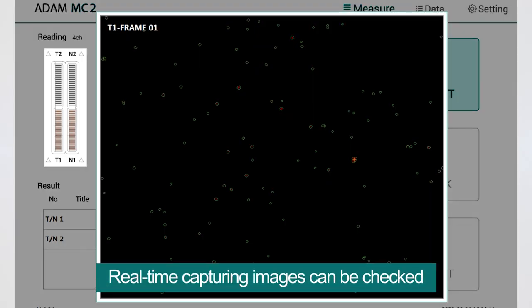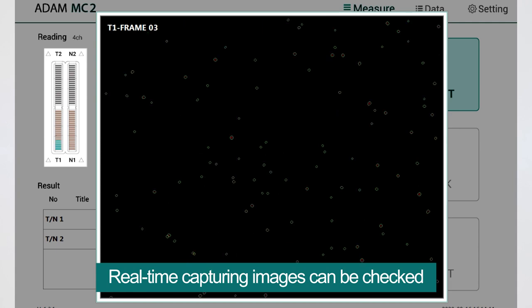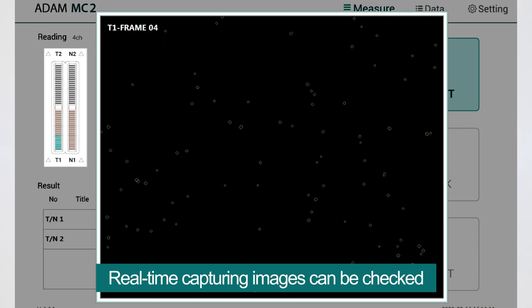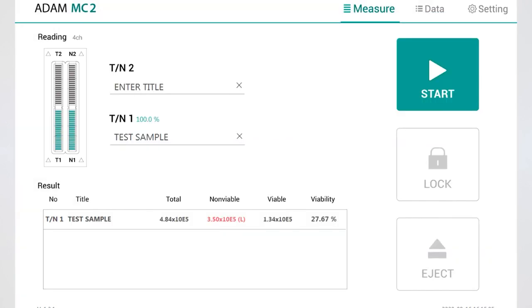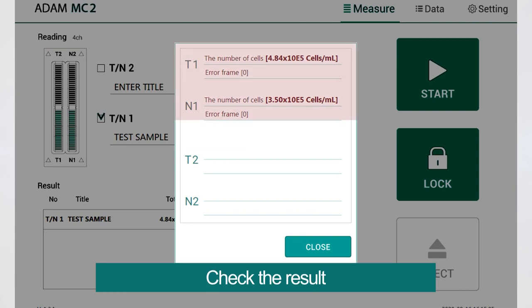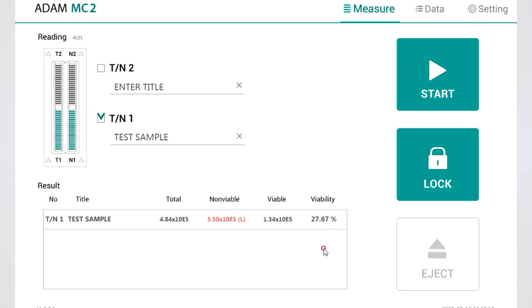While the test is in progress, you can check the cell images of each channel. The result will be displayed after being automatically calculated by Adam MC2 software. The viability will be automatically calculated after each measurement of the total cells and the non-viable cells.